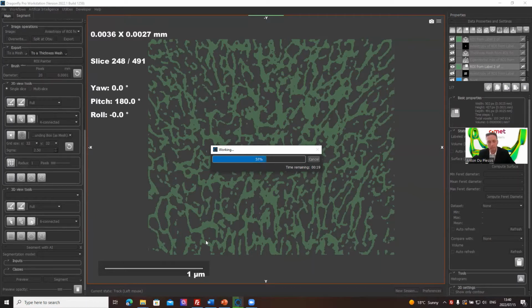Calculating vector fields from that can give us some idea of the directionality. So it's actually being calculated already. I don't need to do the entire thing again, but we'll do a similar thing on the next data set as well.